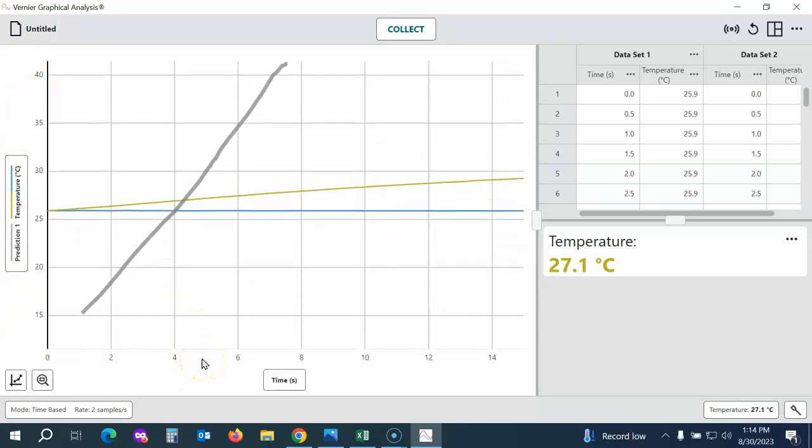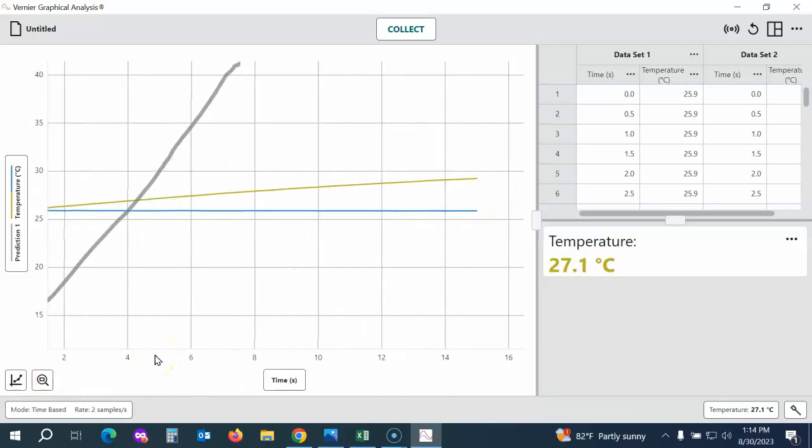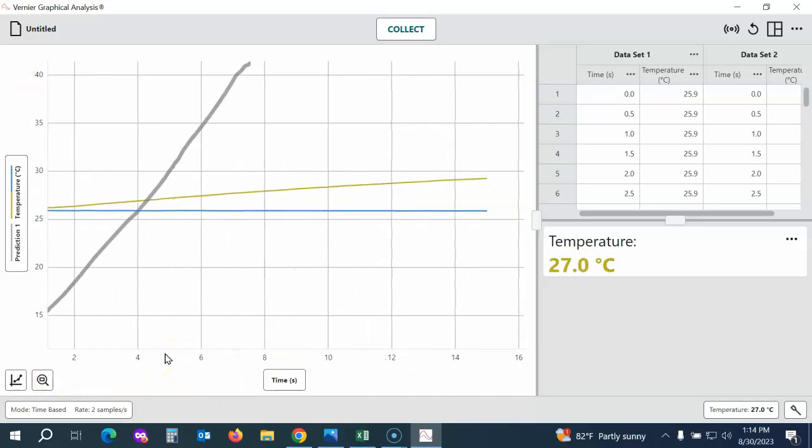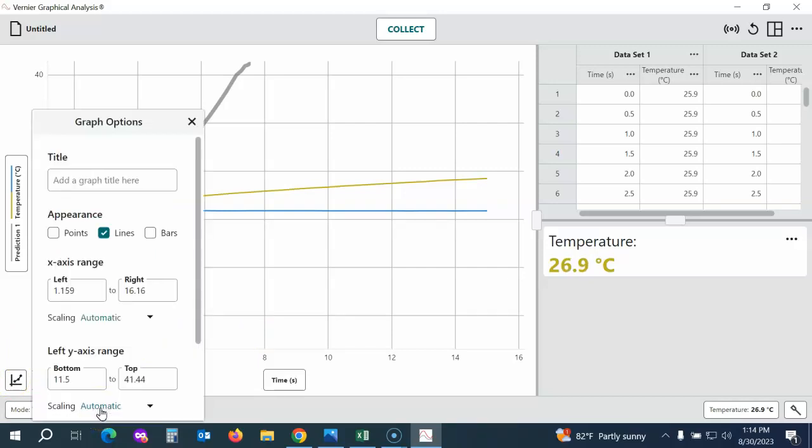You can also come to the x-axis and do the same thing to scroll side to side. If you want to change the x or y-axis, go to Graph Options, scroll to the very bottom, choose Edit Graph Options, and here you can change the scale on your x and y-axis. You can also give your graph a title.